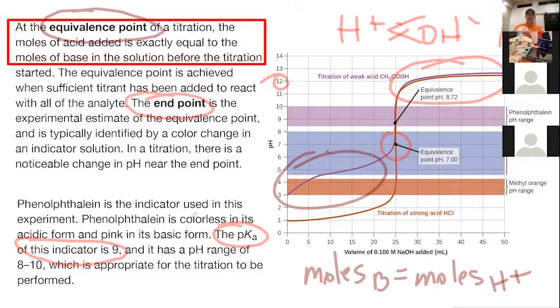It will be diluted, and then the pH of the whole solution will go back to being acidic, and so it'll become clear. So what we want is, as we're swirling and swirling, it'll take longer and longer for that color to disappear. So when we get to that point, we want to basically be adding drop by drop by drop, okay?